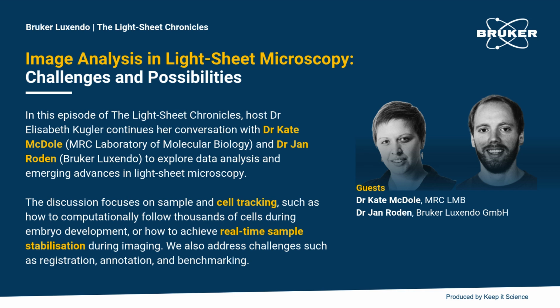Yeah, that depends very much on your application and what your following pipeline looks like, right? What do you want to do with the data in terms of analysis? Often, for example, people who do cell counting or cell tracking need a quite accurate registration, accurate to the single cell membrane, because otherwise cells are miscounted, or if you have doublings in the fused data.